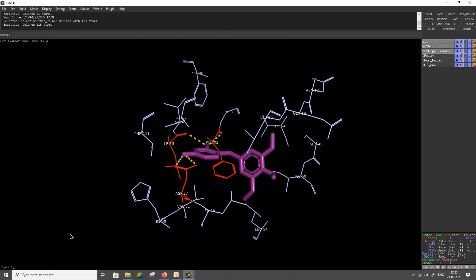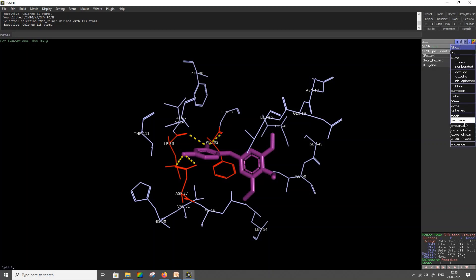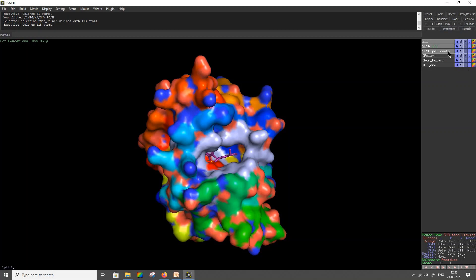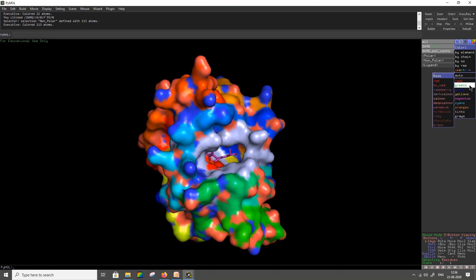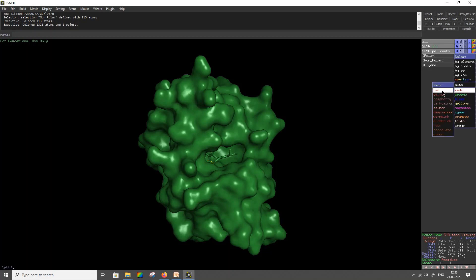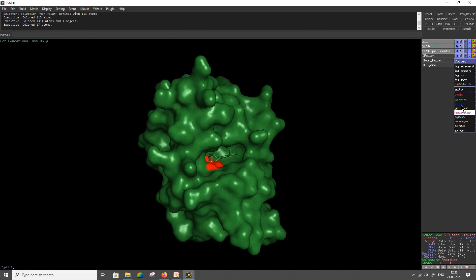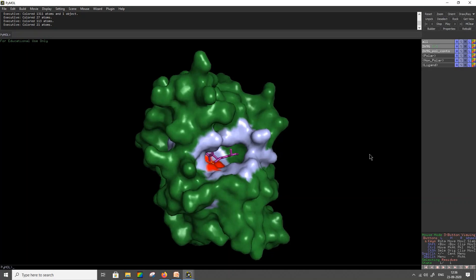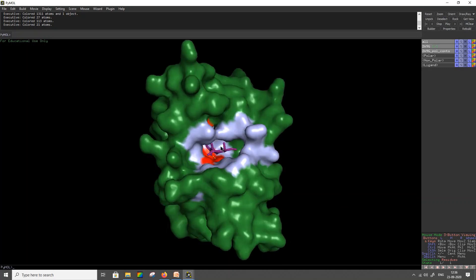This is the annotation of the residues where you can identify what amino acids are forming polar and non-polar interactions with your specified ligand molecule. To visualize this molecule entirely as surface view, click on Show — S stands for Show — then Surface. Now that the entire protein is visible, you have to color code all the individual compartments again: first color the entire protein into a specified color, then select polar and give it red, then select non-polar interactions and give it light blue, then select the ligand and give it purple. Now we are able to visualize the polar and non-polar interactions formed by the protein with the specified ligand molecule.